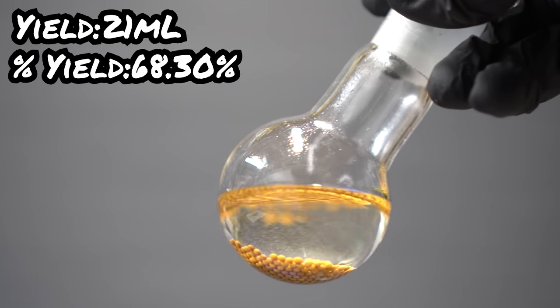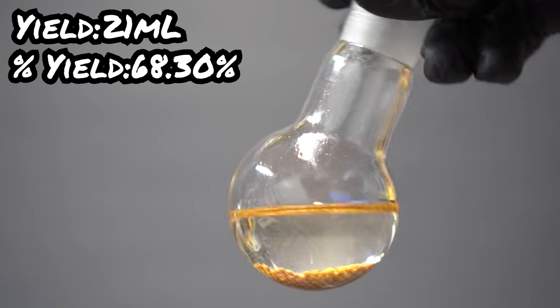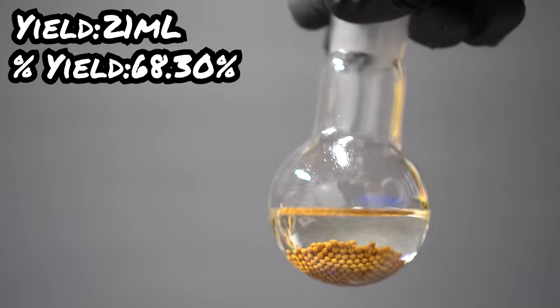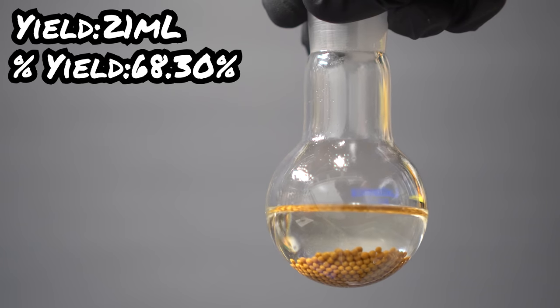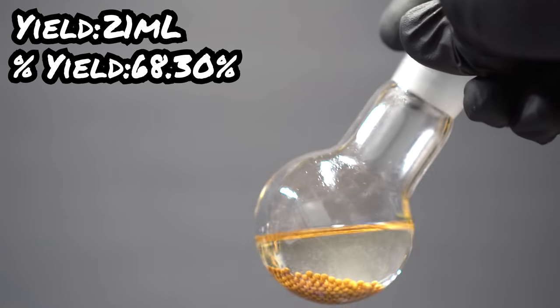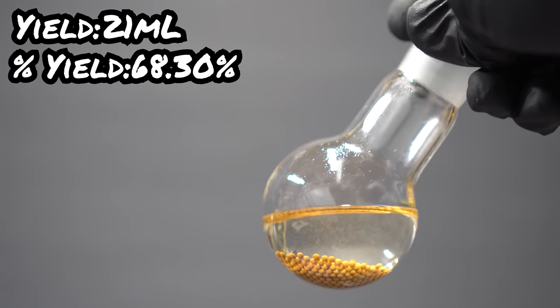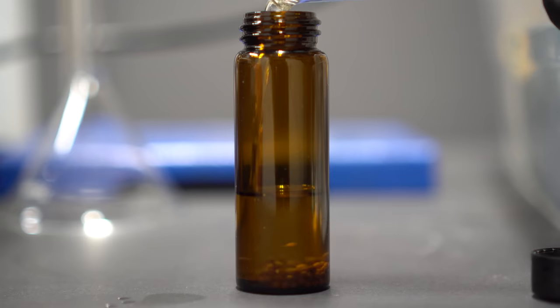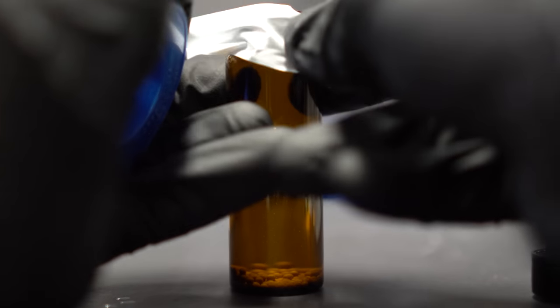My yield came out to be about 21 milliliters, and this equates to a percent yield of 68.3%. All I did was filter the pyridine through a coffee filter, and I measured in a graduated cylinder. I stored the pyridine in an amber glass vial with some fresh molecular sieves at the bottom. I actually need the pyridine for a future video, but I really don't want to give this surprise away.